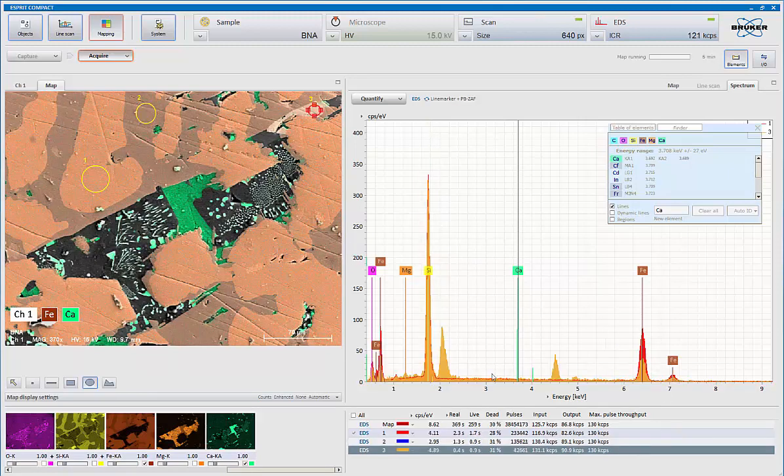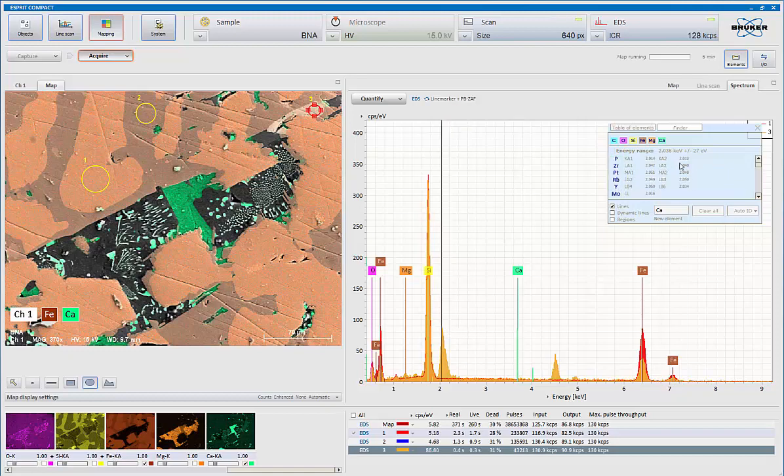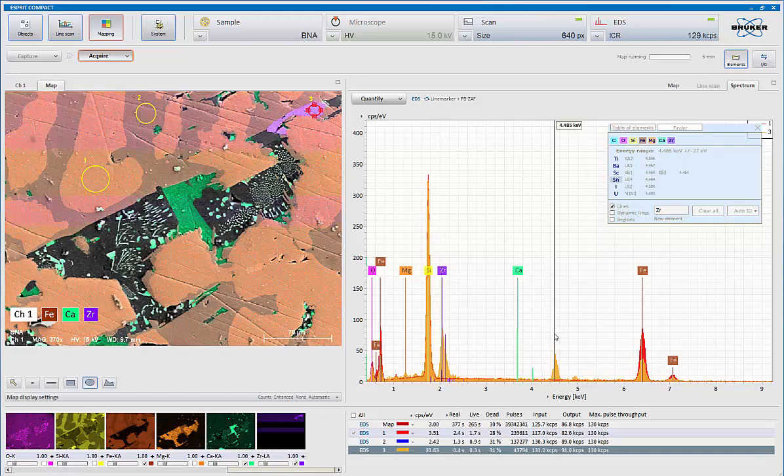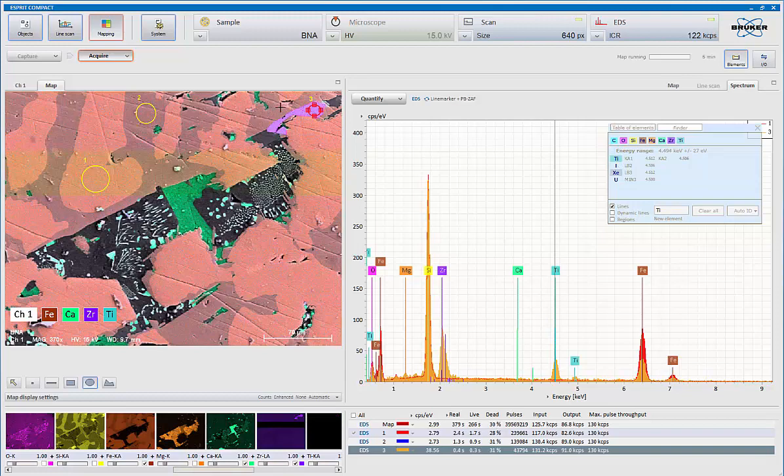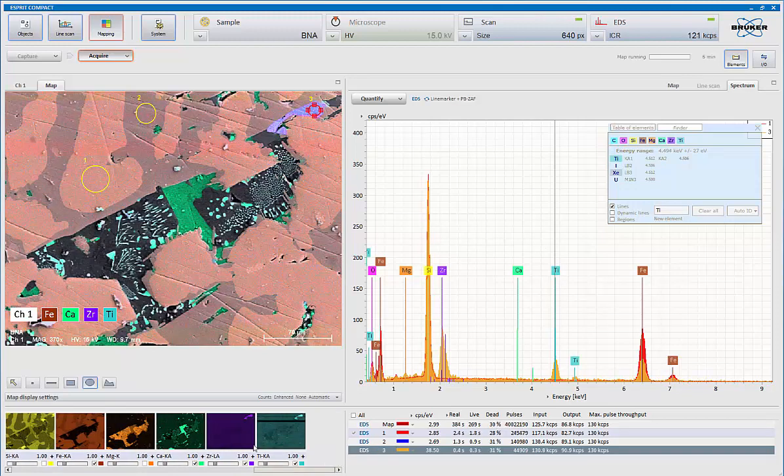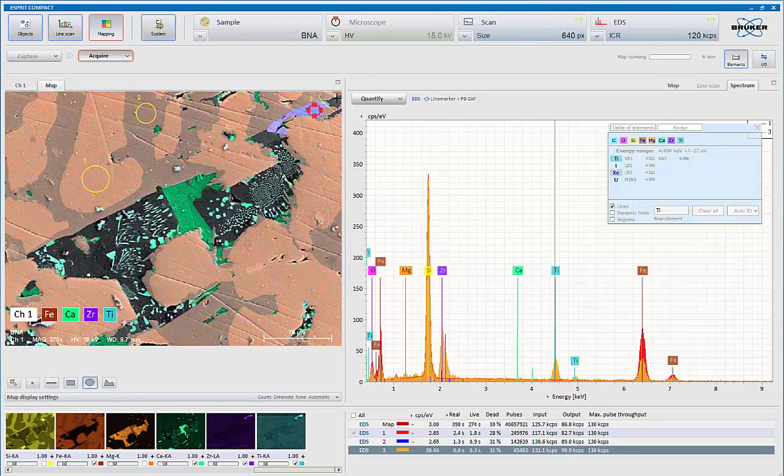Region three, we see we have this peak here, which turns out to be zirconium, and also our peak over here, which turns out to be titanium. So that's this area here, and as soon as I click on it, the system brings up those maps, so I can clearly see that that is just related to that one phase in there.